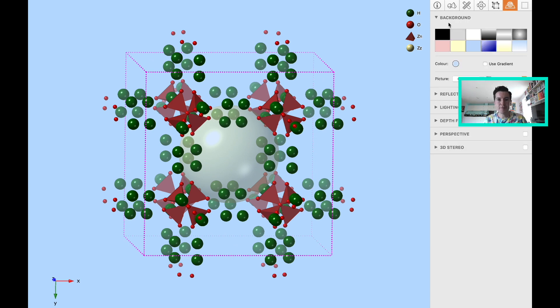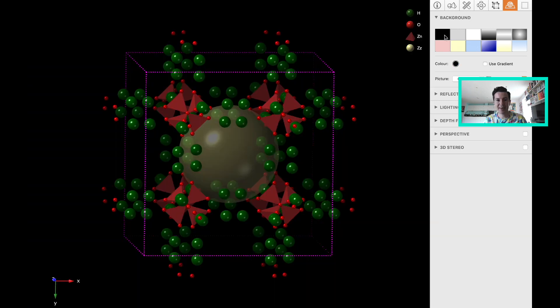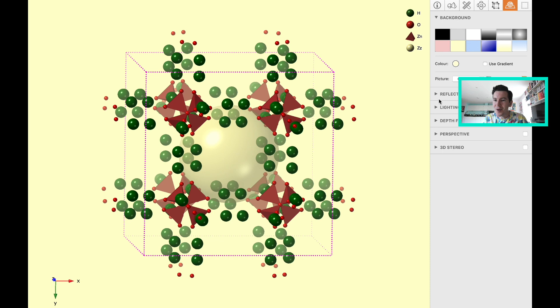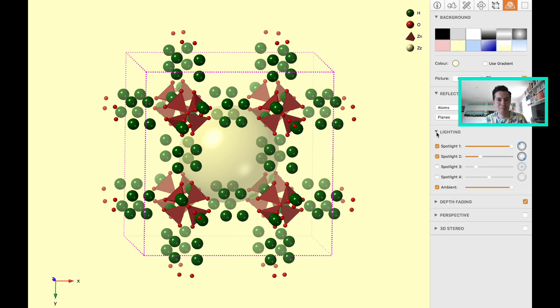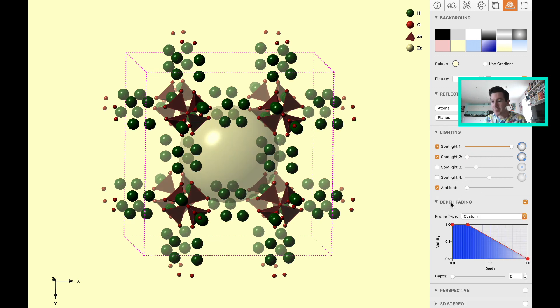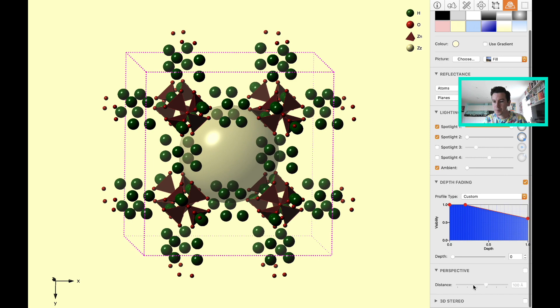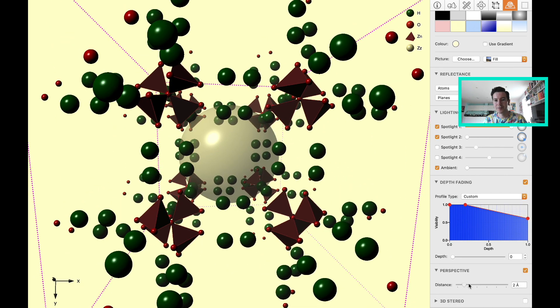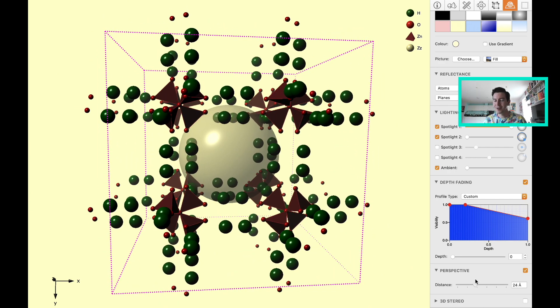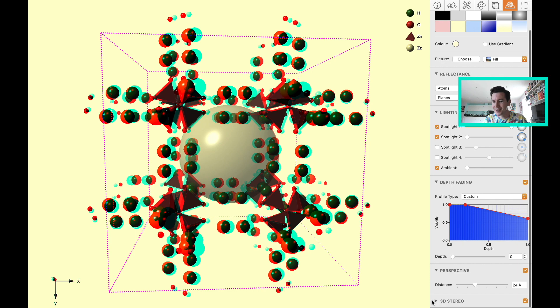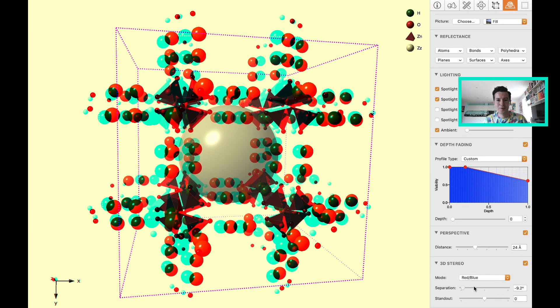The final tab is the visualization details. Maybe I want to change the background to be black, white, or yellow. You can play around with so many different features to get the optimal image depending on what you're interested in. You can have many different lighting sources from different directions, control the intensity of the light, and have depth fading so that a very large structure starts to fade towards the back. You can change from perspective views, which gives you a feeling of the 3D nature in a 2D image. And if you have 3D glasses, you can also create a 3D stereogram, which is pretty neat.